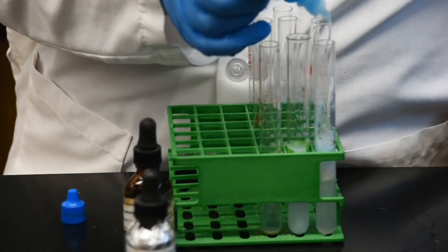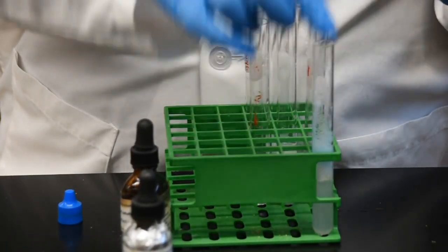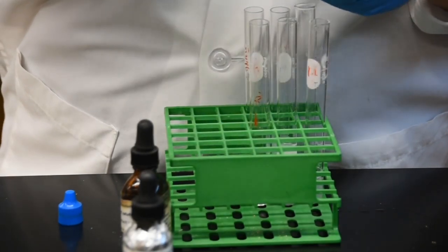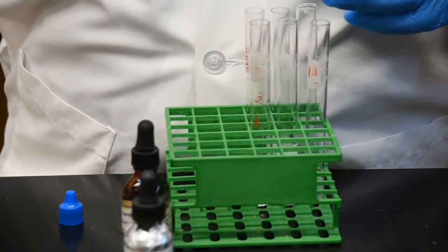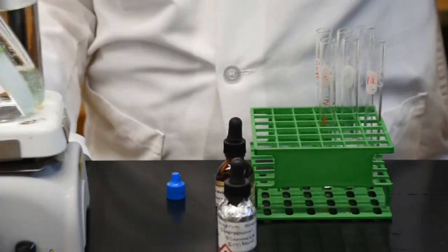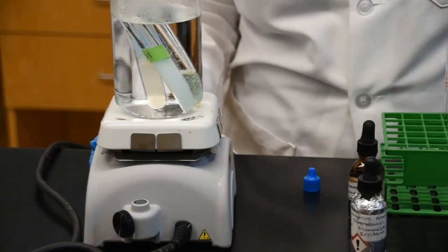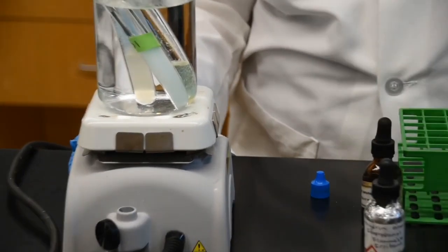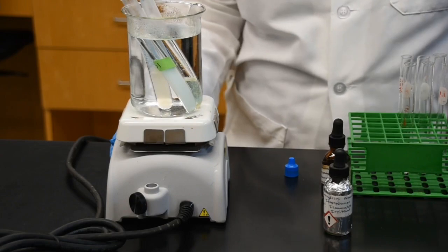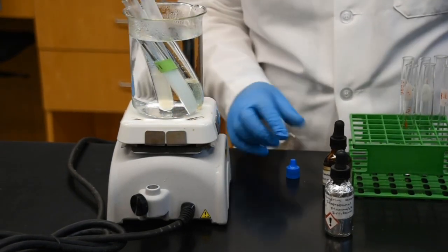And again, remember, what you want to do is mix your sample, and then I'm going to place them inside my water bath. Now, if I do start to see a color change, then I'm going to assume that the glucose or simple sugar was present. If not, I'm going to continue heating it for 5 minutes until the time runs out, and then I'm going to say that the sample was negative.